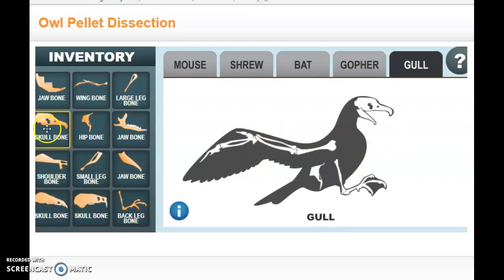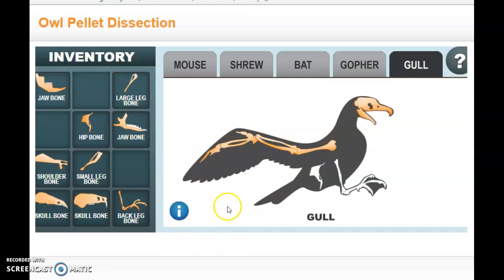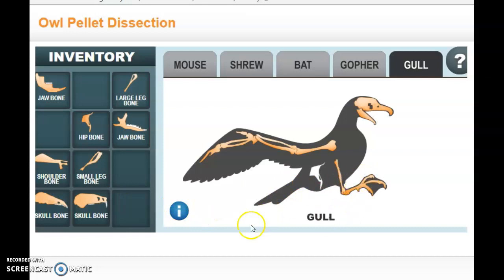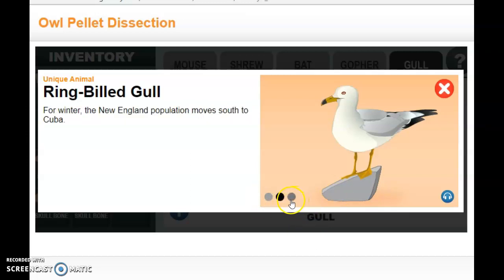Looking at the seagull, this skeleton kind of matches, so I take it and match those bones to the pieces on the skeleton they give me. I can see that this owl last night ate a seagull. Clicking through these dots I can find more information — for winter, the New England population moves south to Cuba — and it'll help figure out where this owl is as well.